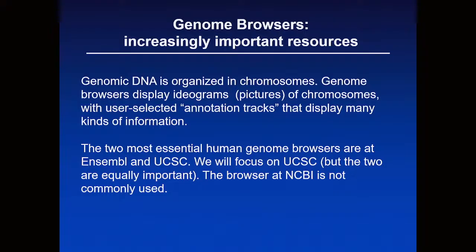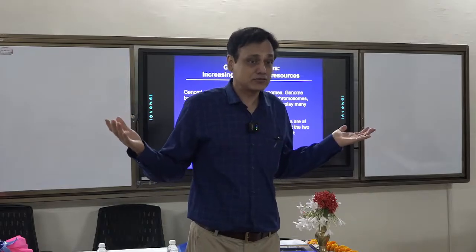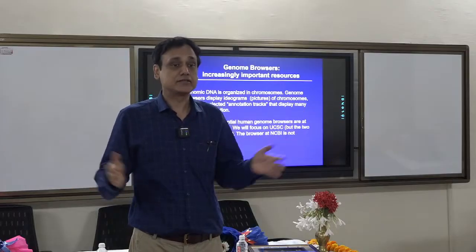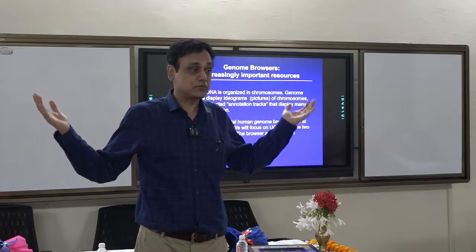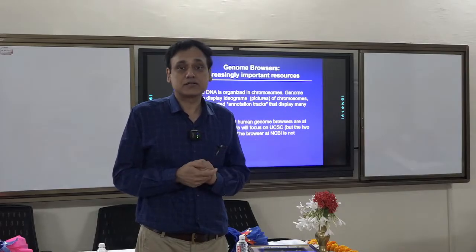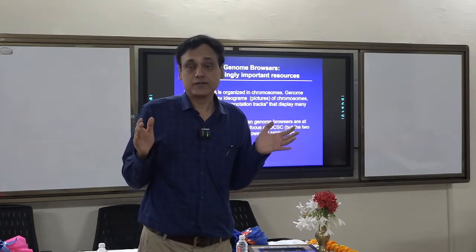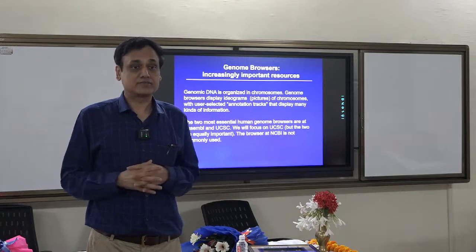Okay, so genome browsers. Because it is being recorded, I will repeat. Genome browsers are important for visualizing genomes, and they are not just for visualizing, but you can also use them for downloading the data. Genomes are quite long often. For example, the human genome has over 3 billion nucleotides, so you want an efficient tool for visualizing and analyzing the data.